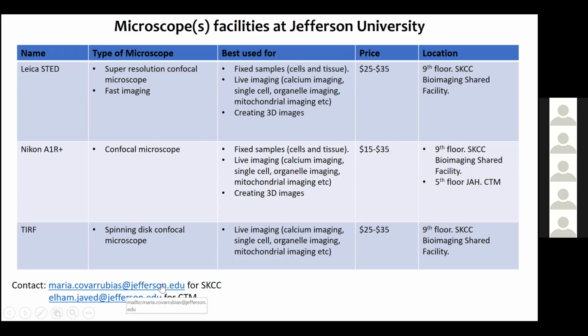And so the different microscopes that are available at the imaging facility, I've just listed the top 3 over here. So they have a Leica, which I personally have not used, but if anyone else has used it, please let me know. Please raise your hand in the chat. It is advertised as having super resolution, whether it be through their different objective lenses or through the software processing that they have.